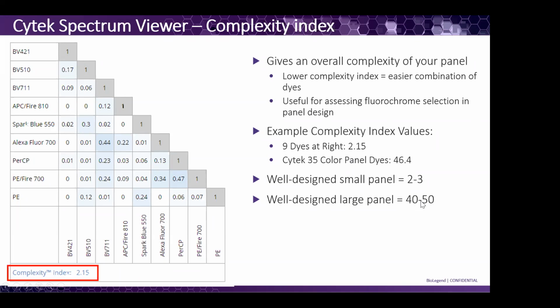So it ranges between 40 to 50 when you have a really large panel. This is just a good thing to check before you really start to work with the panel, so you know how complex it actually is.